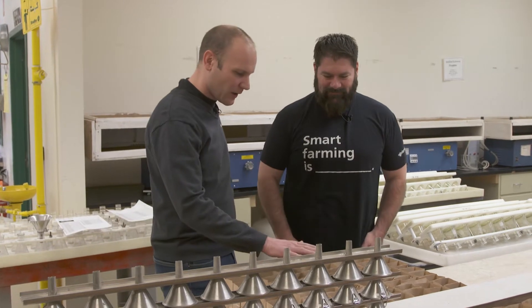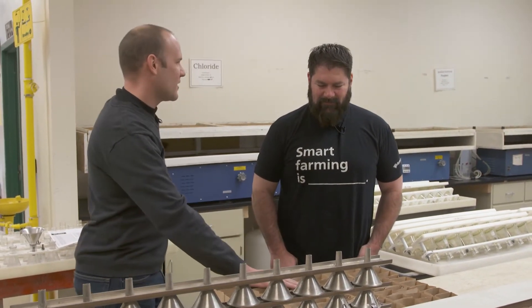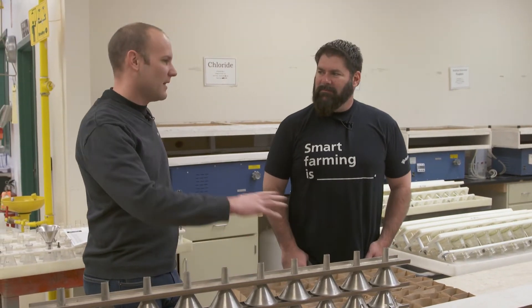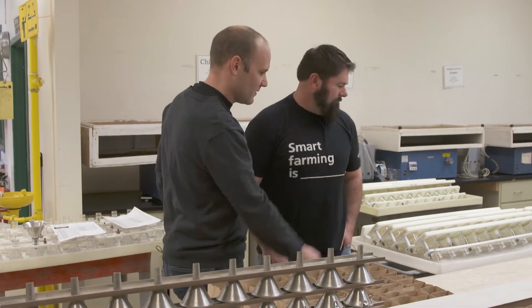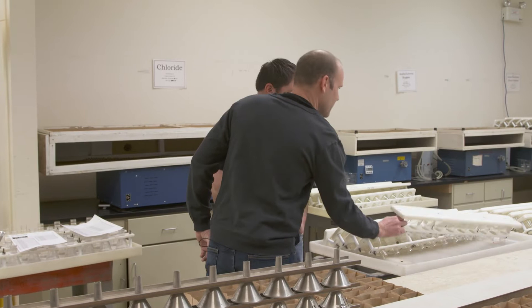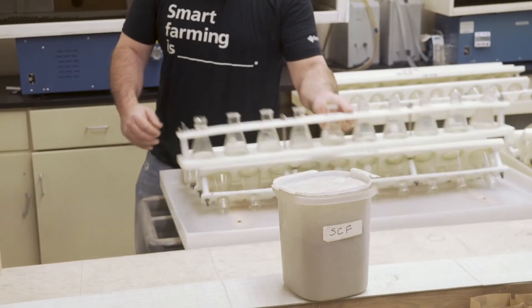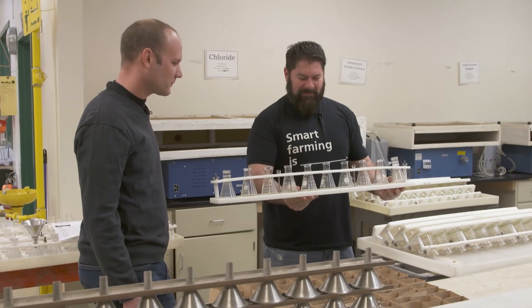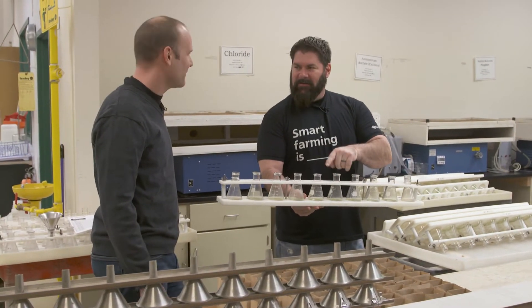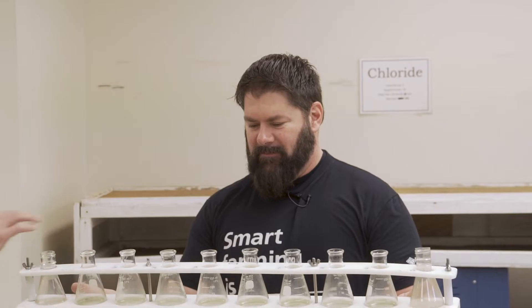Once we've got all of our soil ground, we've got a couple of different stages we'll look at. In the area we're standing in now, this is mostly all the wet chemistry extraction. The sample is scooped into one of these extraction manifolds here — that looks very science-y. It is bona fide science. You fill these with soil, add in the extraction chemistry, and they're going to go on a shaker.